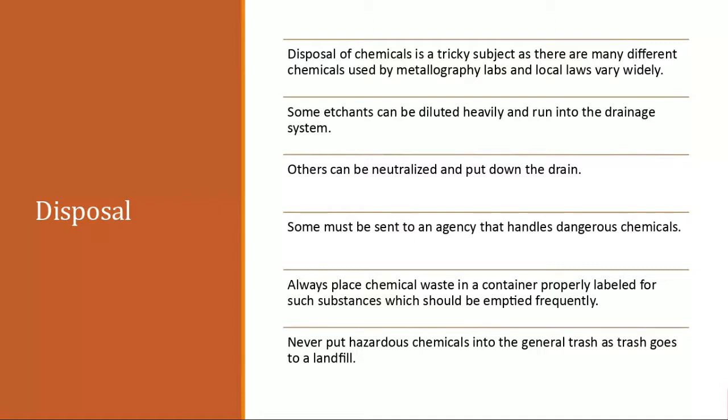But if you are dumping anything into those containers, you'll need to document what exactly you dumped into each of them, so that when EH&S picks up the containers, they have an idea of the chemicals that have been mixed into those waste containers.